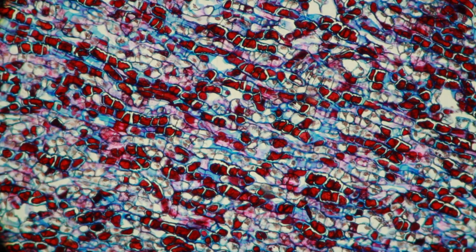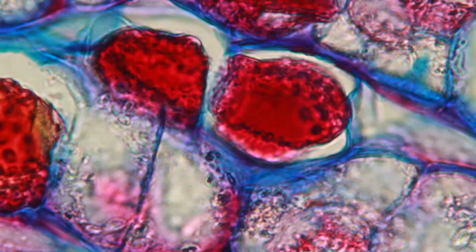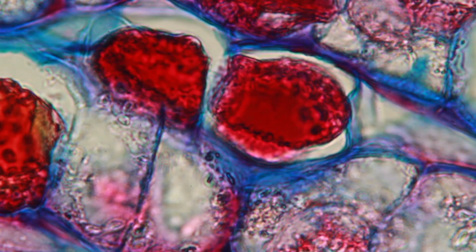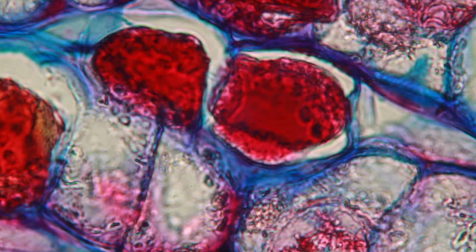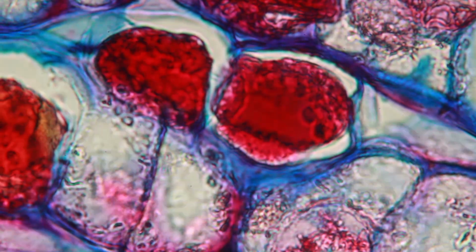And when you switch to a higher magnification, however, then sometimes it's like this, that even if you close it completely, you're not able to see the circle. But I'm now opening and closing it, and maybe you can see that there is a slight improvement in contrast when you close it. It's very slight, but you can maybe see the image become brighter and darker. There is a small contrast change, and this is because stray light is reduced, and therefore image quality is slightly improved.